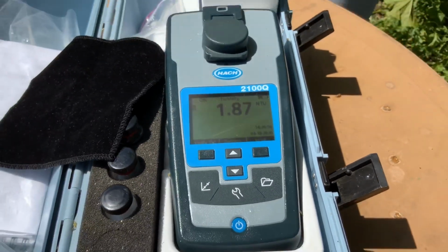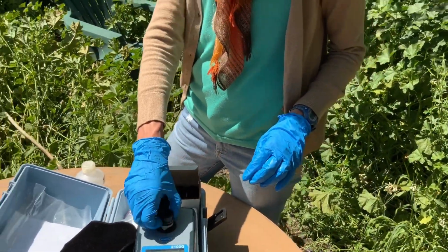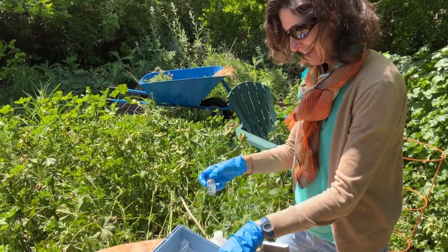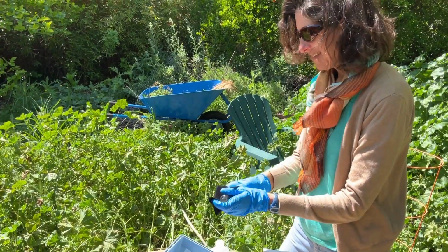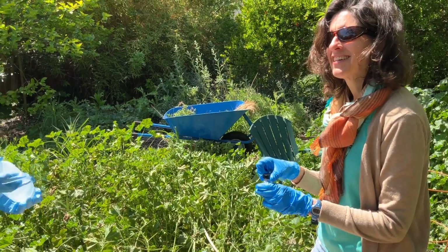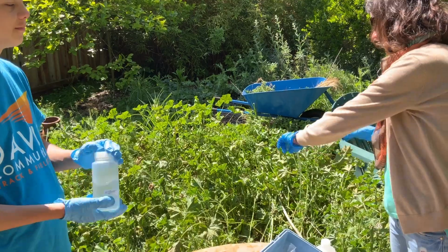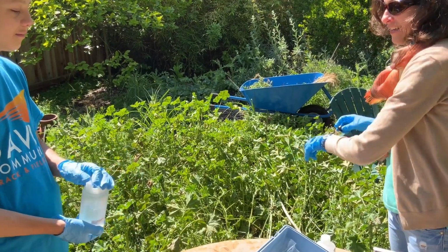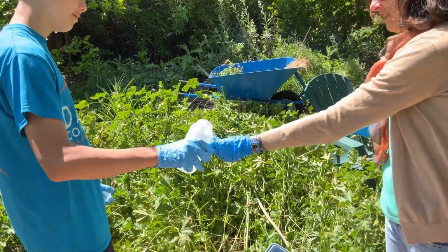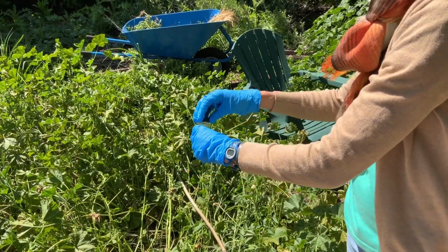1.87. Well, that is not within the amount of error I would want. So we might have to cut this. No, I'm just kidding. So I would do it again. Let's do the gentle inversion 10 times. It's probably a lot more, but yeah, that's good. We won't get any bubbles in it this time.